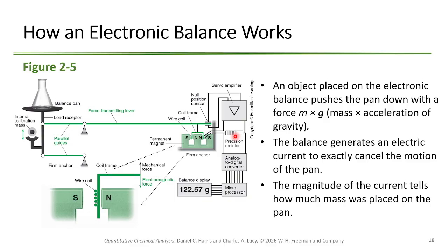Now, when we're measuring mass of something in a gravity well like Earth, what are we actually measuring? Can you measure absolute mass? No, you're measuring the weight, mass times gravity. And so what you're actually doing whenever you're using a balance is measuring weight. That's why you typically call it weighing things, because you actually are weighing. It's only if you were without gravity in space that you could actually measure mass, though even there it'd be arguable if you can do it. Okay? It's not that simple.